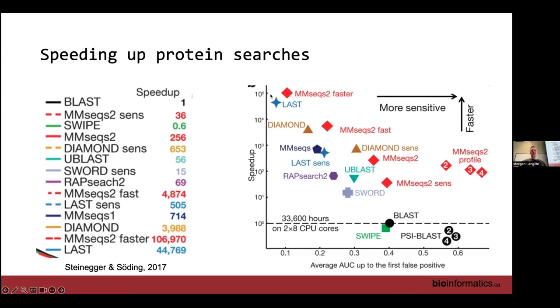This is not really a plug for myself, but like anyone else, we developed our own pipeline as well within Microbiome Helper. It's very similar to the backbone of HUMAnN, although we'll see the slight difference. It's a bit more computationally intensive, because with HUMAnN there's an approximation step. Or you can design your own. You're growing bioinformatics people who now know the basics of what goes into a pipeline. You just get your data, grab a database, make a database, start doing stuff, normalize a little bit, and bam, you've got tables of functions. Just like that.